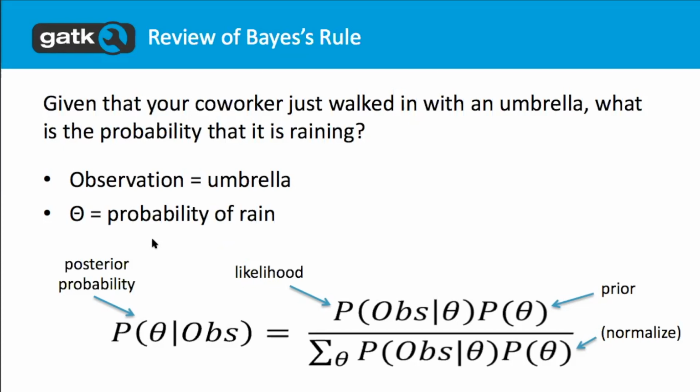We just don't expect it to happen as much. We're not going to let that override the actual data that we have, but if there's some ambiguity, we're going to use that expectation to modulate our decision. That is the entire concept behind genotype refinement.